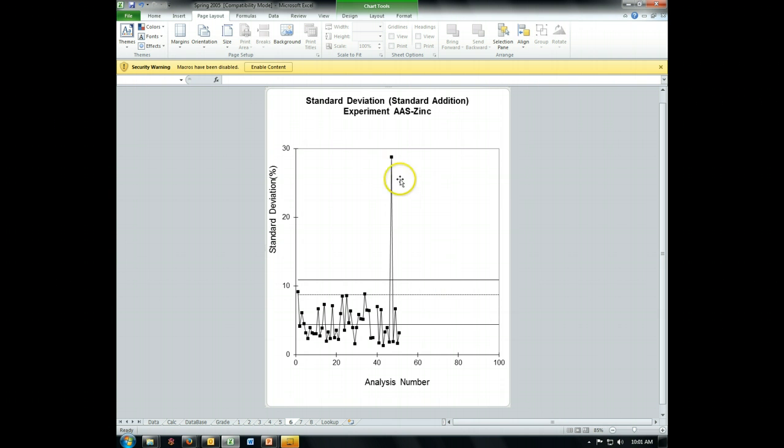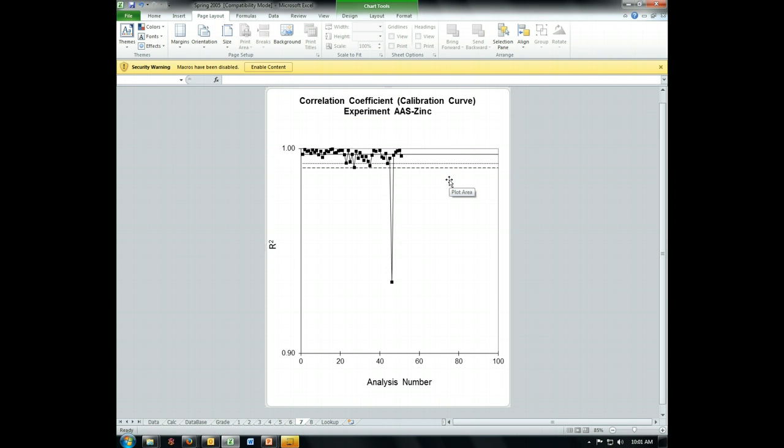For the standard addition technique, once again, actually this is operator 47. So this is a different assay that would have caused us to shut down because we have a massive standard deviation spike. 2 more, you can see here's another one. Our R squared is garbage for that. Instead of a weak one being 0.9908, notice that's the weakest of all of these clusters. The rest of these are very linear. This is still reasonably linear. Down here we're saying only 93.5% of the behavior is attributable to a straight line model. The rest is caused by some other uncontrolled variable or by random noise. That's a real good reason to shut down right there.